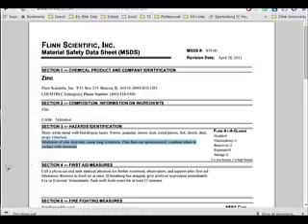All right, let's see what else it says about metals. This stuff, it can spontaneously combust. What does that mean? On its own. So zinc dust can just catch on fire with moisture in the air.